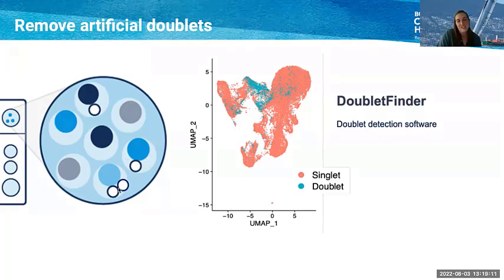And so this is the part that doesn't get filtered out as much from the cellranger count function from that pipeline. They'll get rid of things that might be cells that aren't cells because they don't have much mRNA expression, whereas they won't get rid of ones that might be 2 or 3 cells that were labeled as 1. And if you have 2 or 3 cells labeled as 1, by the time you're in RStudio, you have no idea. And you can be running downstream analyses on things that are incorrect and not biologically accurate.